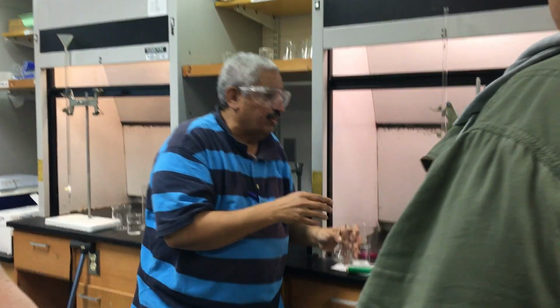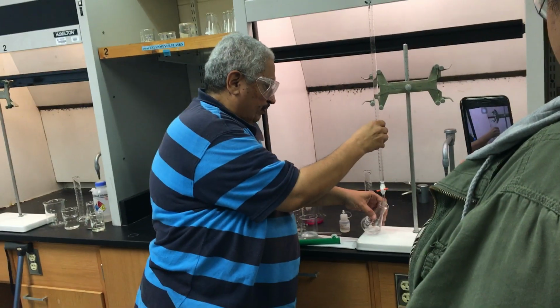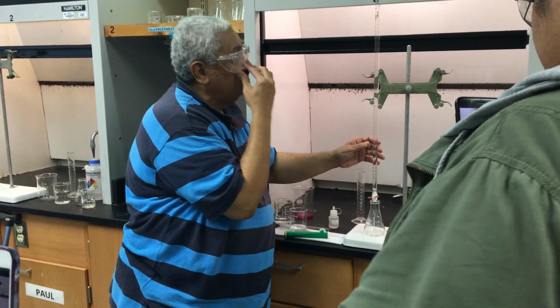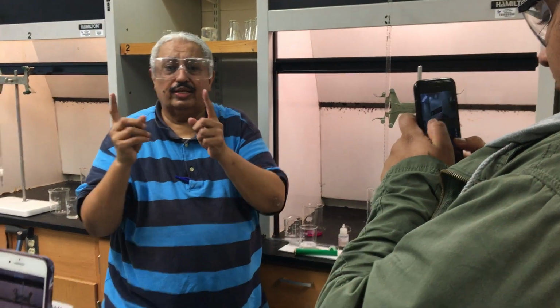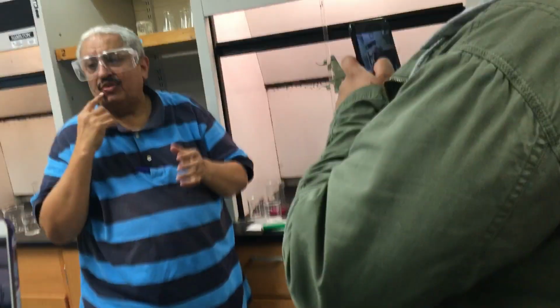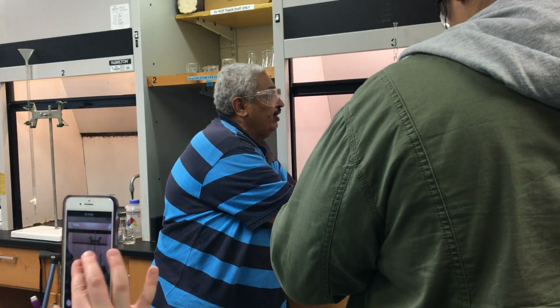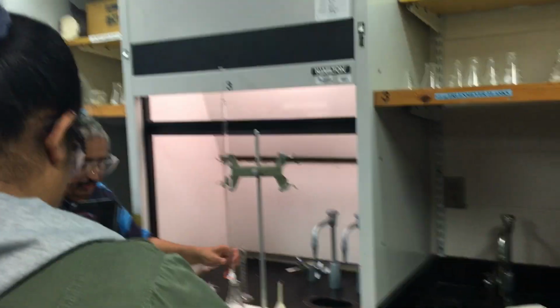Now I'll start generously here. I'll take the whole thing up, and I have to bring everything down. So I'll start. I don't know where the end point is. The end point is when the color changes from colorless to what? To pink. And this pink stays at least for 15 seconds. It's not disappearing, correct? So now let's see here. I will add generously 1 mL at a time, but at the same time I need the tissue to see the color very well.